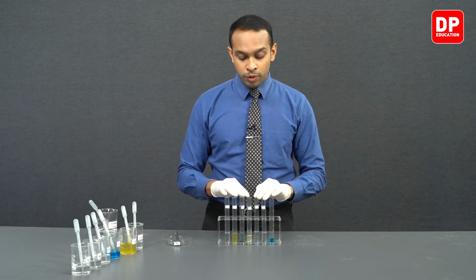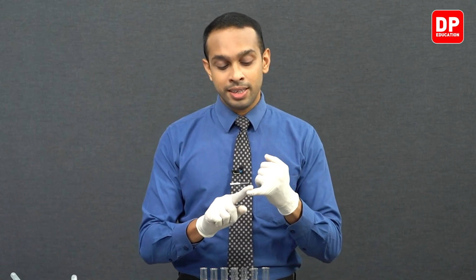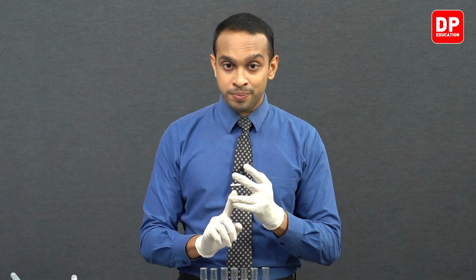So students, we observed in this part of our experiment that iron, or Fe solid, is more reactive than mainly two elements, and those elements are lead and copper. Iron is more reactive than lead and copper.